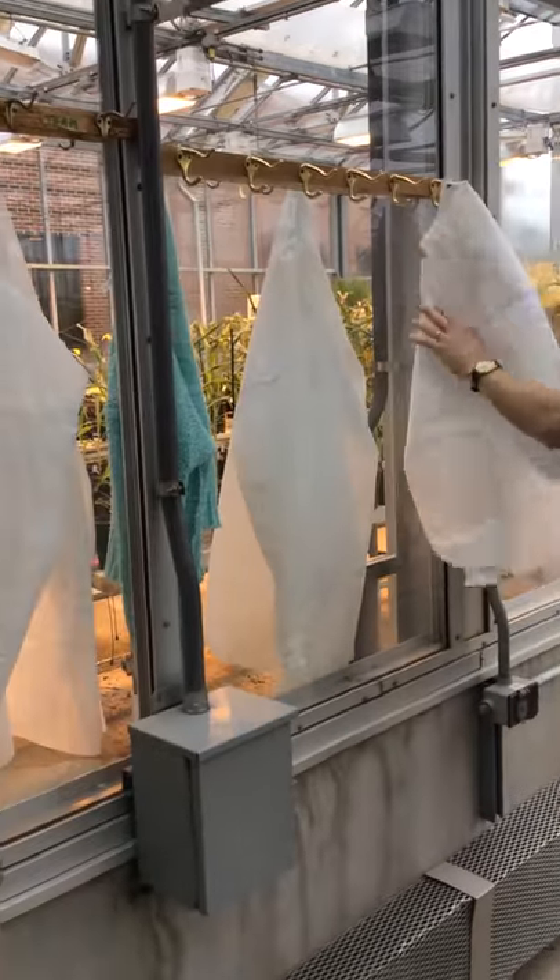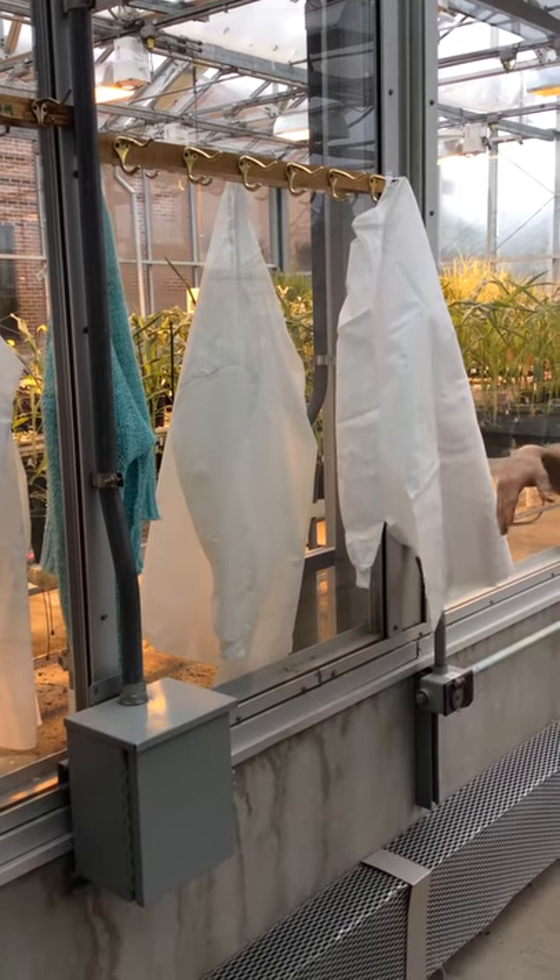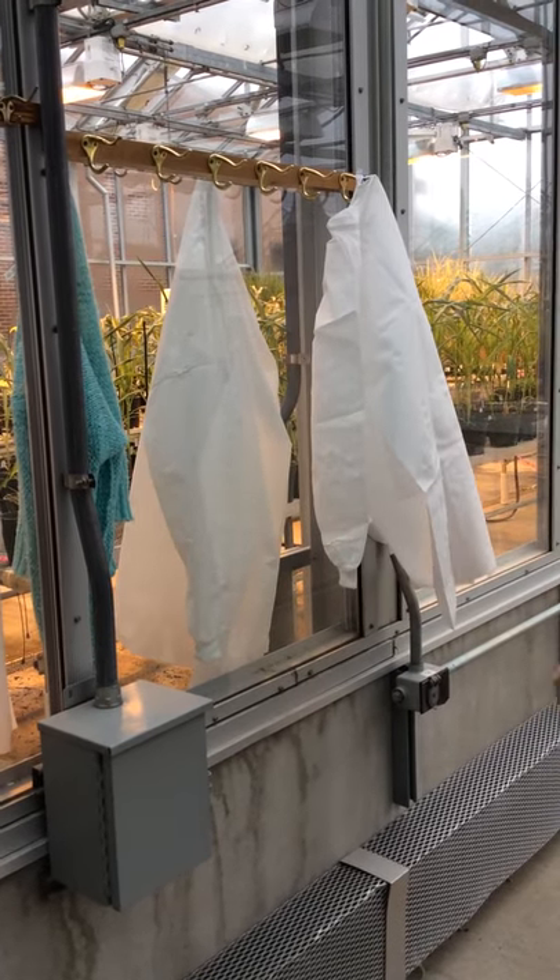So you just hang up your coats and leave it there. It's probably good for a month, but of course if you get it really soiled you can get a new one anytime you need.